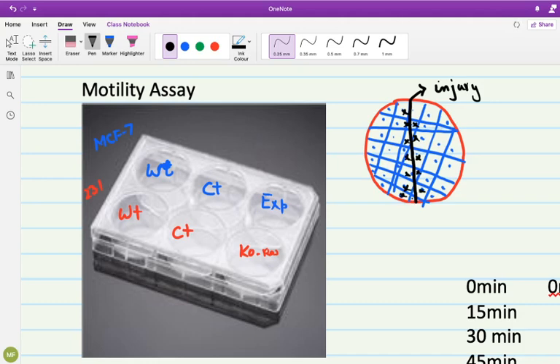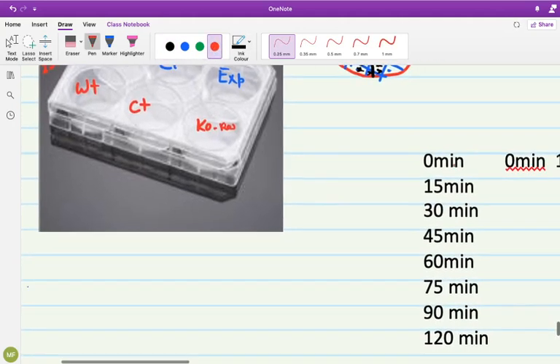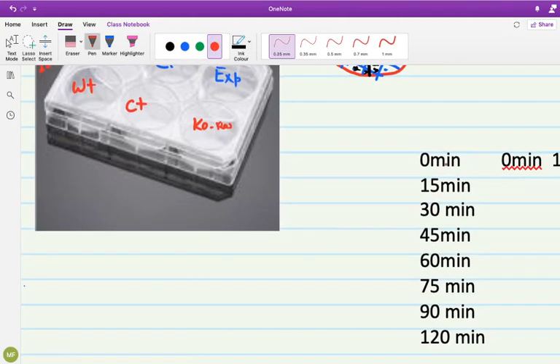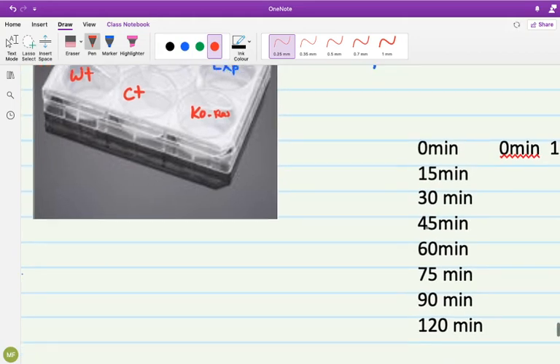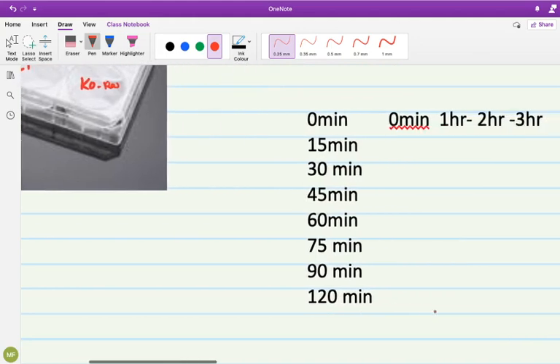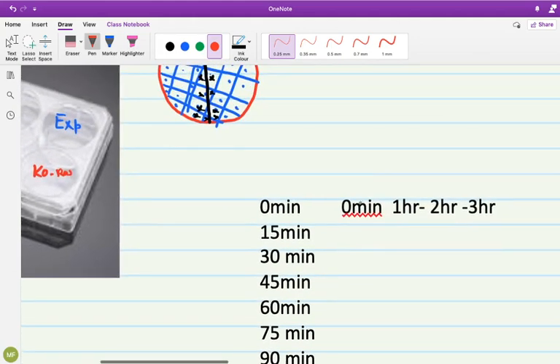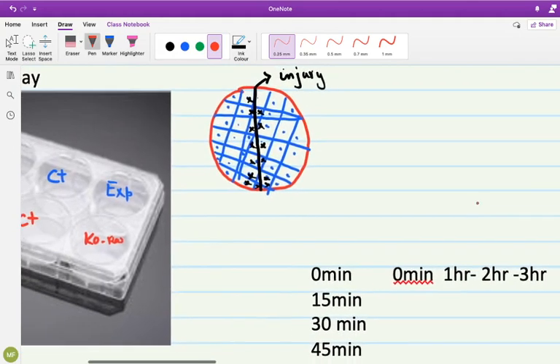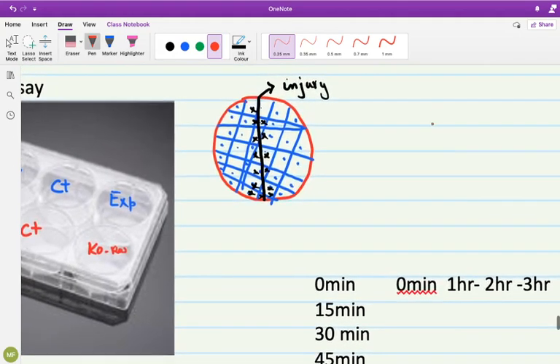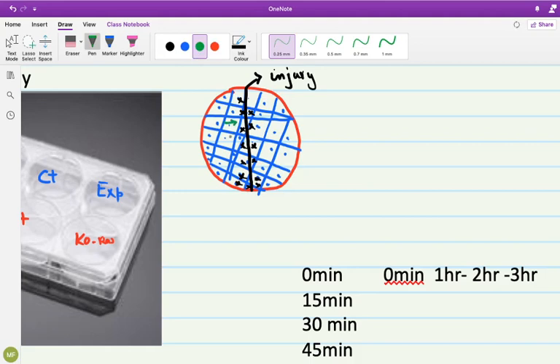We intentionally induce a wound. The wounding is something which is unique to this assay. This is an injury or intentional wound making happening over here. So we injure a portion of certain cells. The cells in the vicinity may die. It's cutting into two halves. The injury may be induced by any needle or tip. Then we take an image at zero minutes, then 15 minutes, 30 minutes, 45 minutes, 60, 75, 90, and 120. In some labs, the assay would be defined as zero minutes, one hour, two hours, and three hours. Generally, three sort of readings are being derived. The idea is to see how much time these cells take, how much time the neighboring cells take to cover this gap.